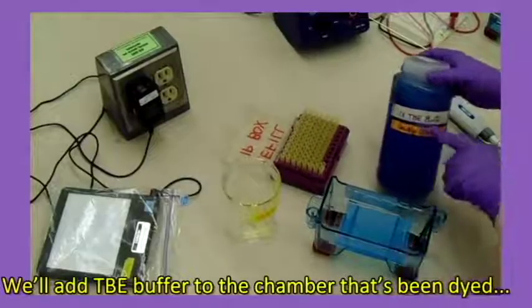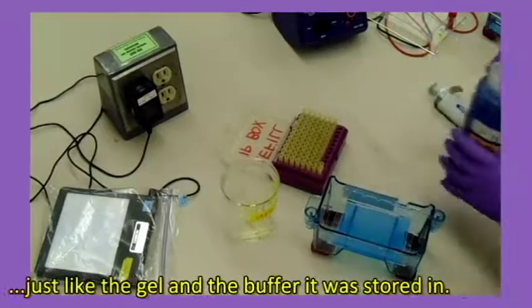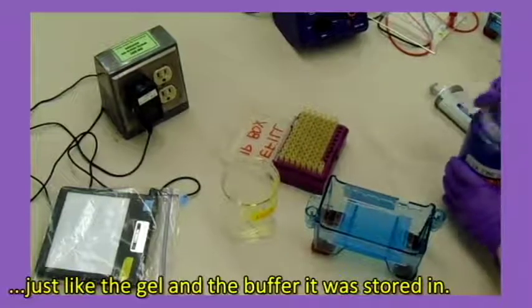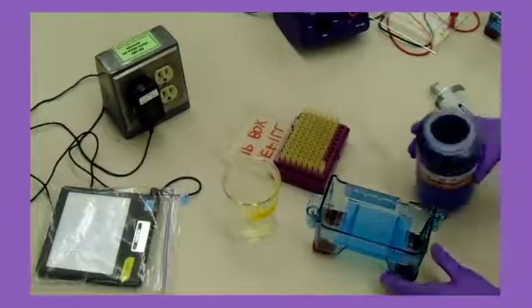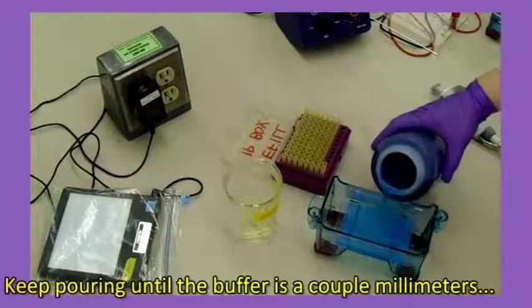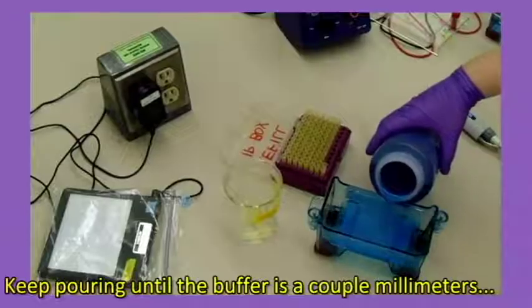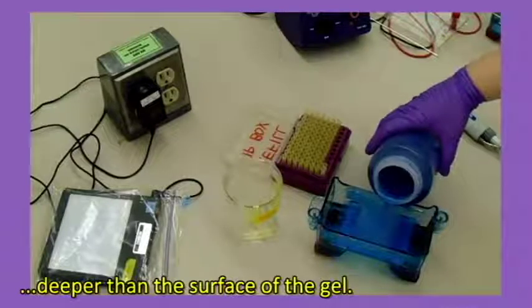We'll add TBE buffer to the chamber that's been dyed just like the gel and the buffer that it was stored in. Keep pouring until the buffer is a couple millimeters deeper than the surface of the gel.